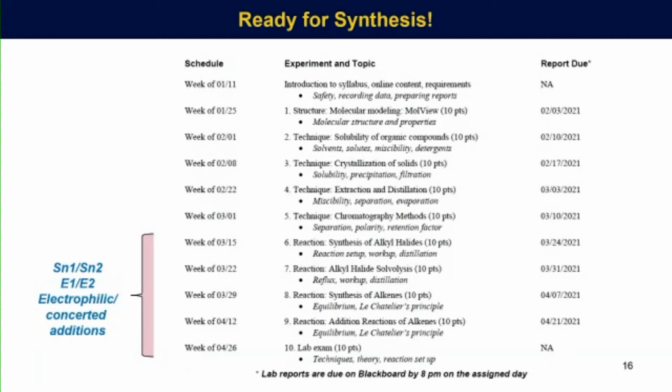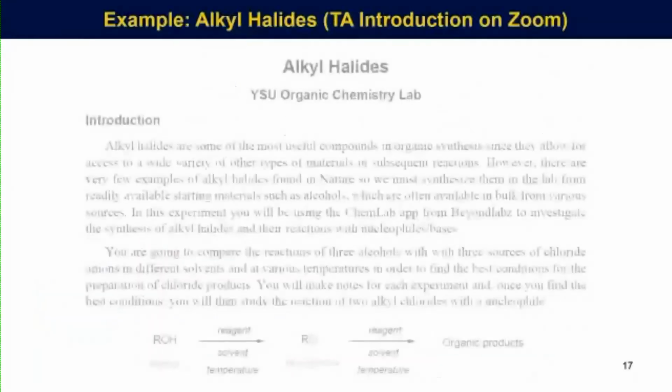And towards the end of the term, we started taking the leash off and said, just go find out and start experimenting. And you cannot do that in an undergraduate lab, at least with TAs doing this. So this worked very nicely. I'll give you one example of a sheet that we did, one example of a reaction that we have here, and we're ready to go.